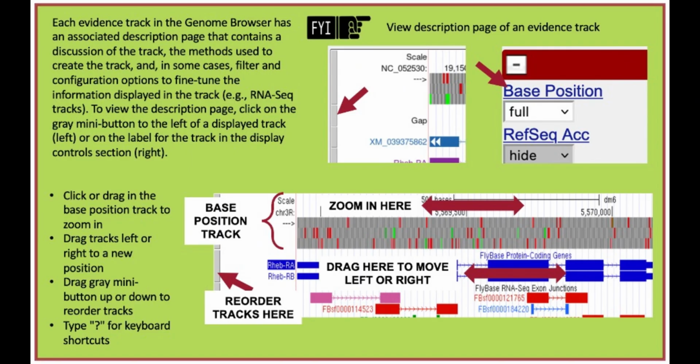This image is a guide to help users interact with and customize the genome browser interface to analyze genomic data effectively. I will be demonstrating these instructions in the next section.